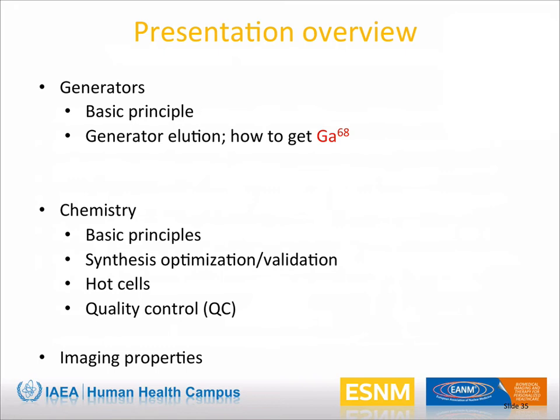Presentation overview. We're going to speak about the germanium-gallium generator, the basic principle, how to elute the generator, chemistry, basic principles, synthesis, optimization, validation, hot cells to work with gallium-68, quality, and finish off by the imaging properties of gallium-68.